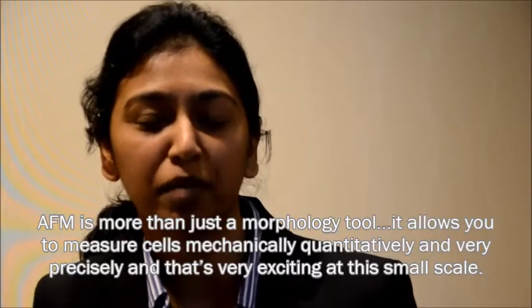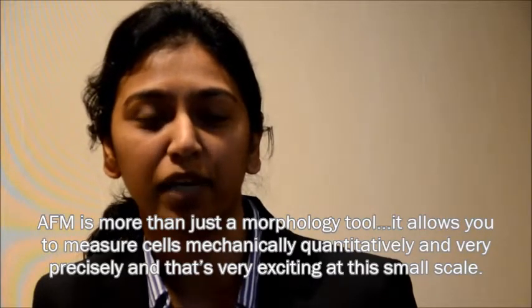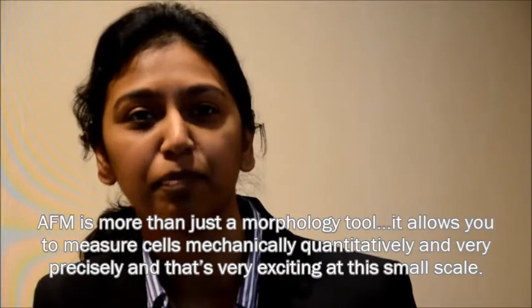What is fascinating is it's not just a morphology tool, but it allows you to look at cancer cells in ways that it hasn't been seen before, to push on them, to pull on them, to measure them mechanically, quantitatively, and very precisely. And that's really exciting at that small scale.